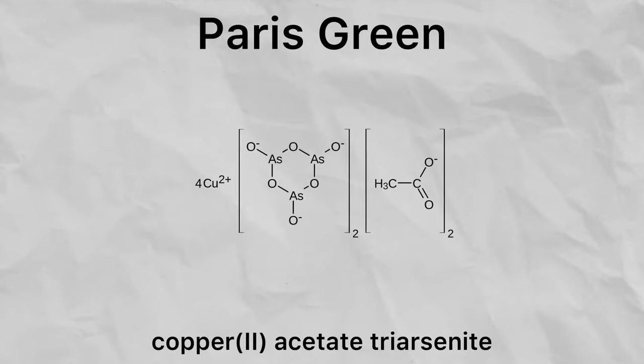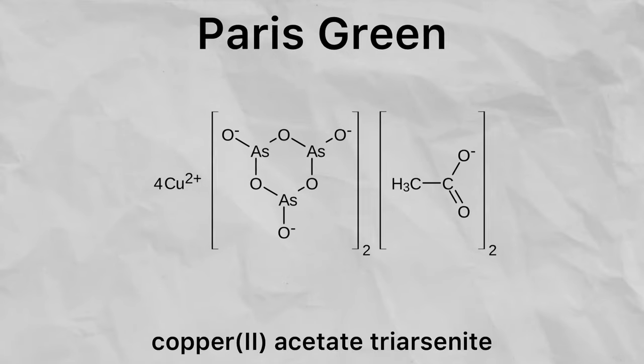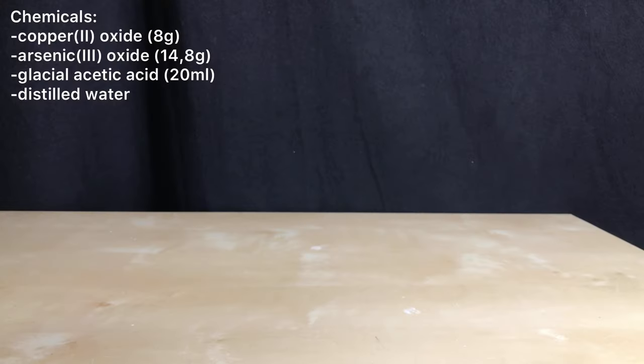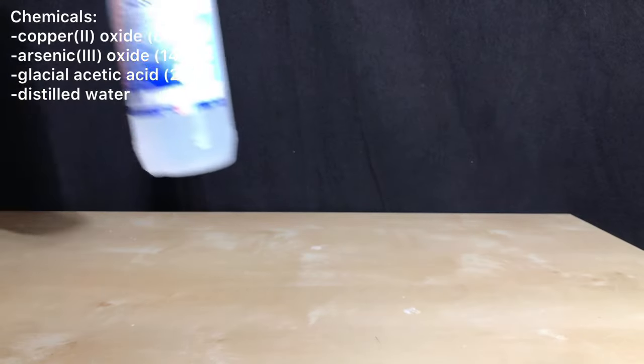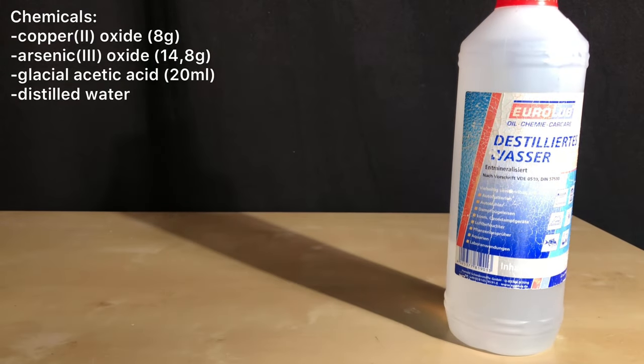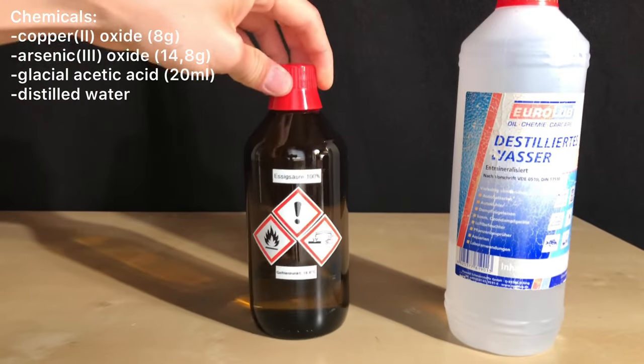Welcome back everyone. Today we are going to make a very toxic pigment called Paris Green, or also Copper 2 Acetate Triarsenite. This pigment has been used for painting walls and for making green dresses and it led to numerous poisoning accidents. Without much more talking, let's begin.